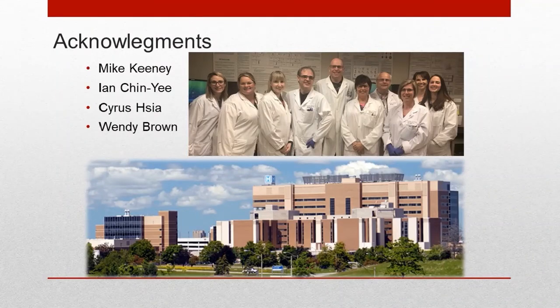Thank you. Someone else in the audience is curious as to why CD34 is present in all four of the tubes. I think I alluded to that one before. The CD34 allows you to go between the tubes, especially if you have a blast population that expresses CD34.